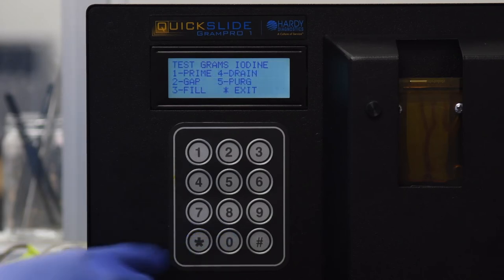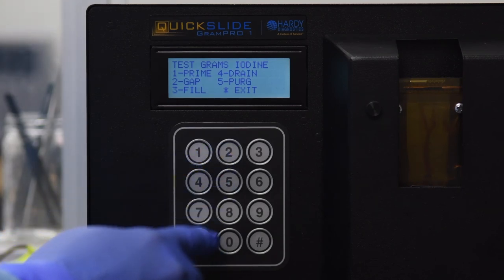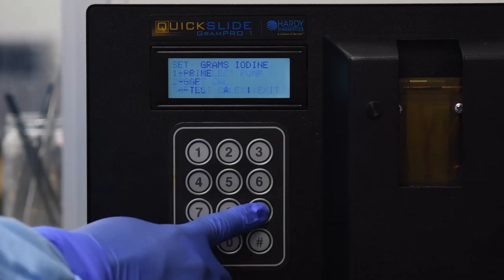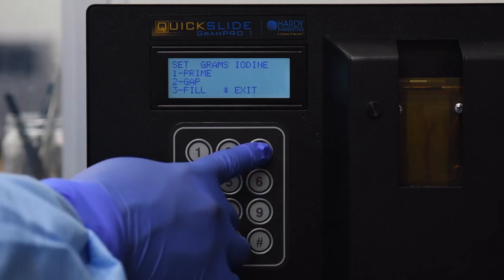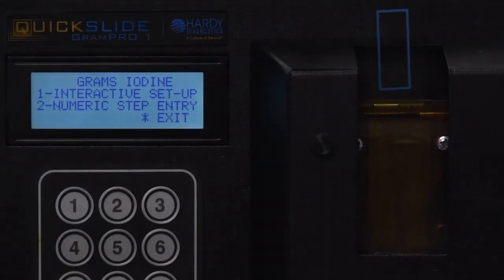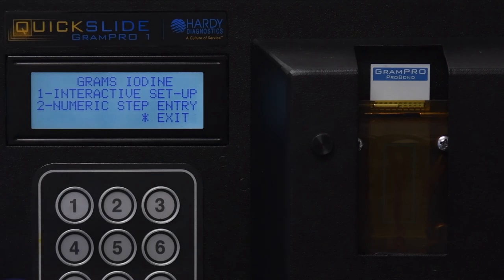Press star two times to exit back two screens. Press 0 to select Test Calibration, press 4 to select Drain, press 2 to select Gap. Press star to exit back one screen.